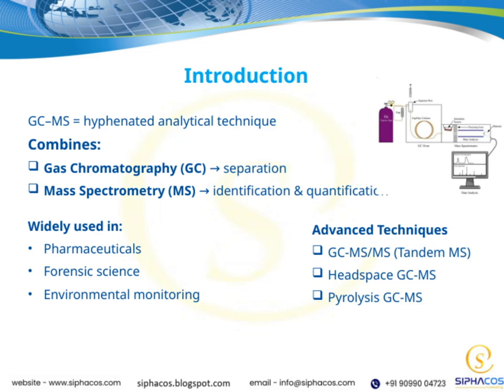Then we have pyrolysis GC-MS, which involves breaking down complex materials at high temperatures to understand their composition. Think of it as a way to analyze materials that aren't easily vaporized.